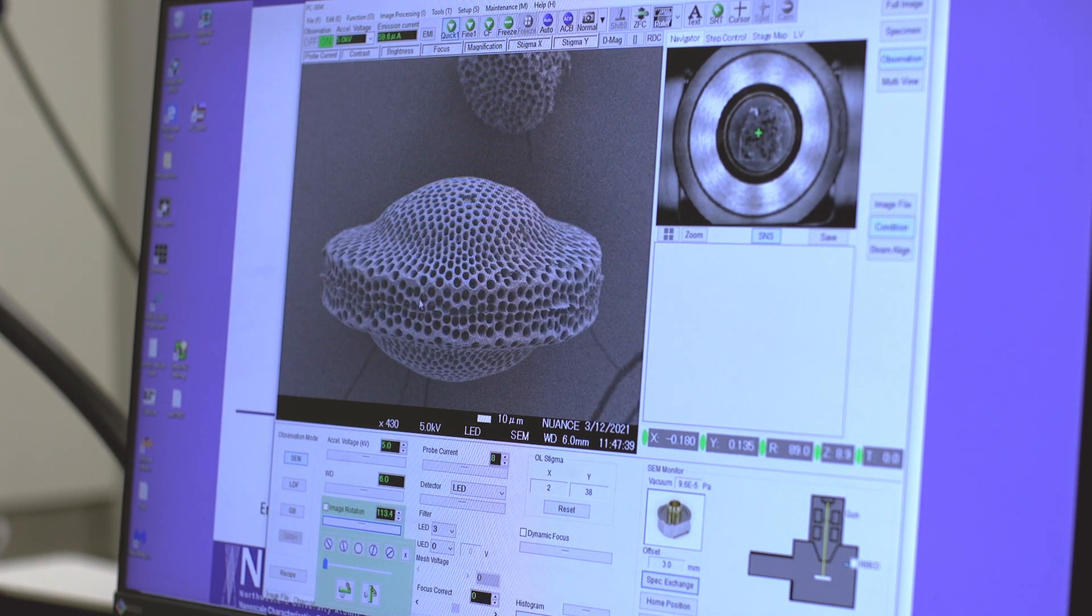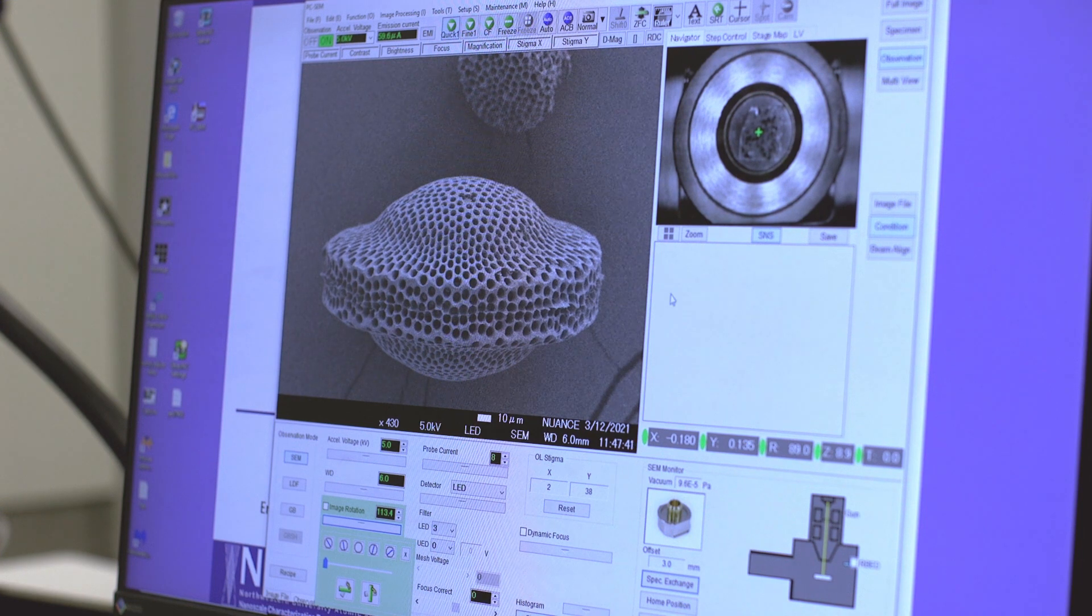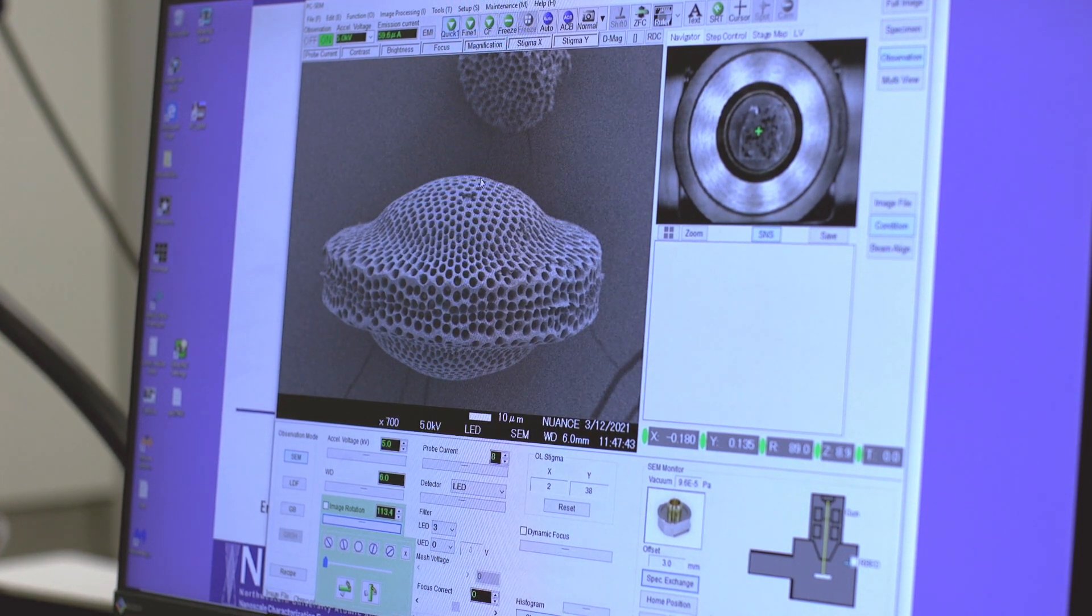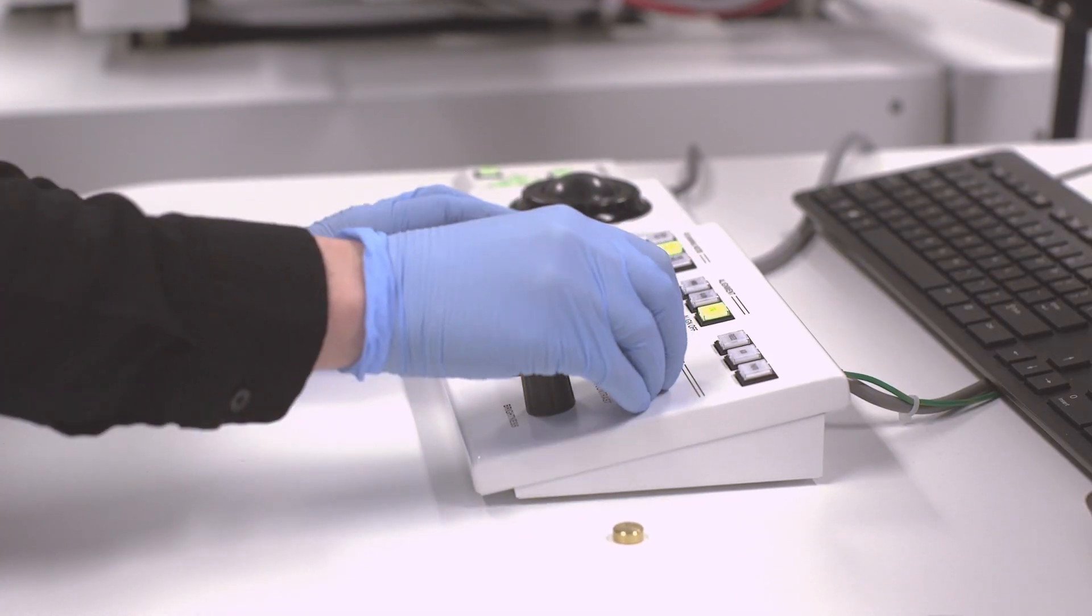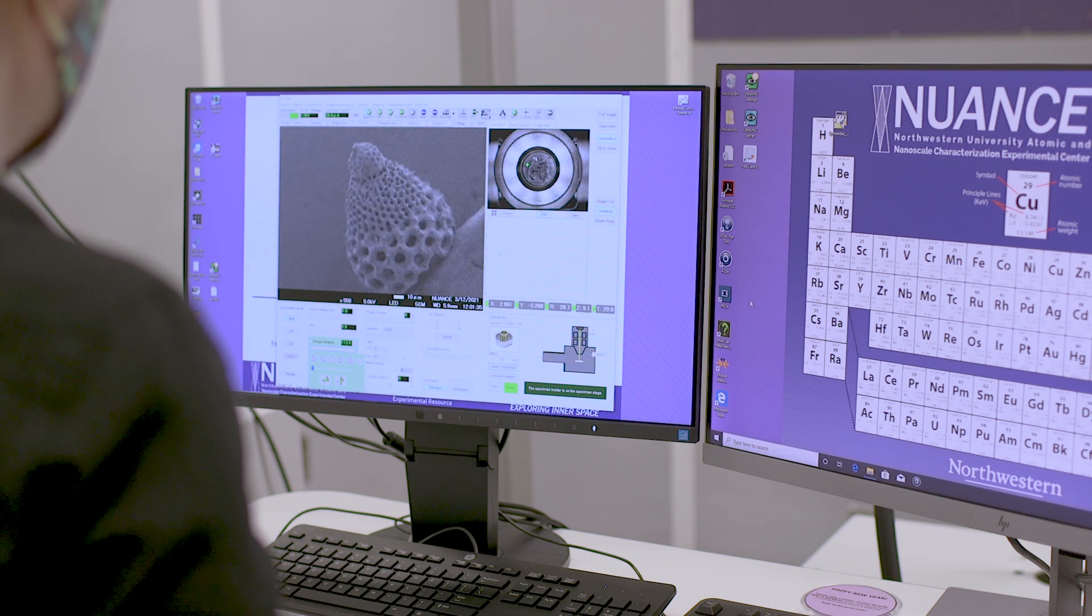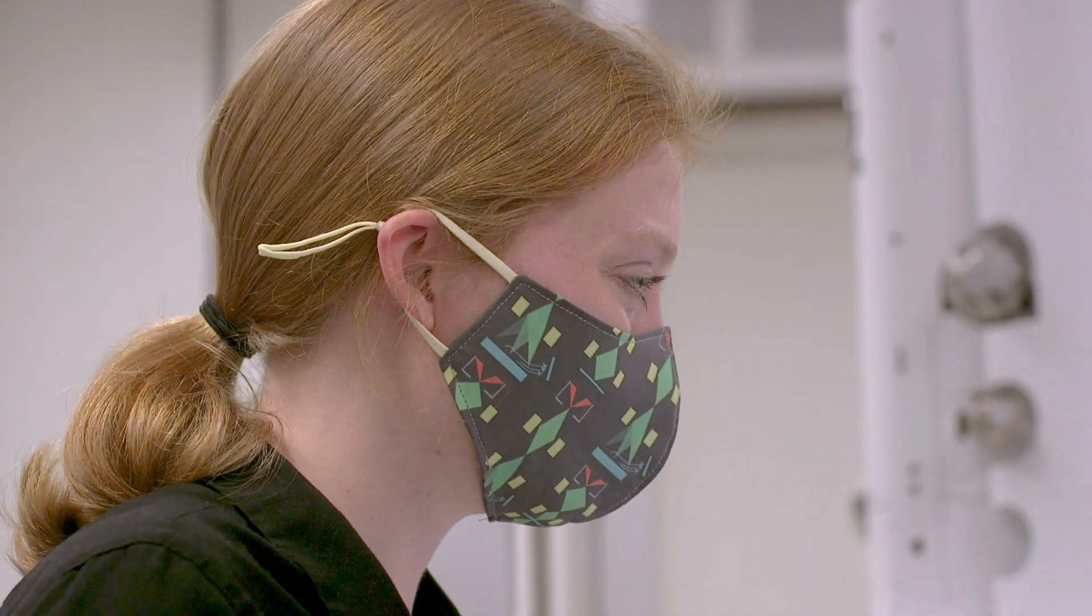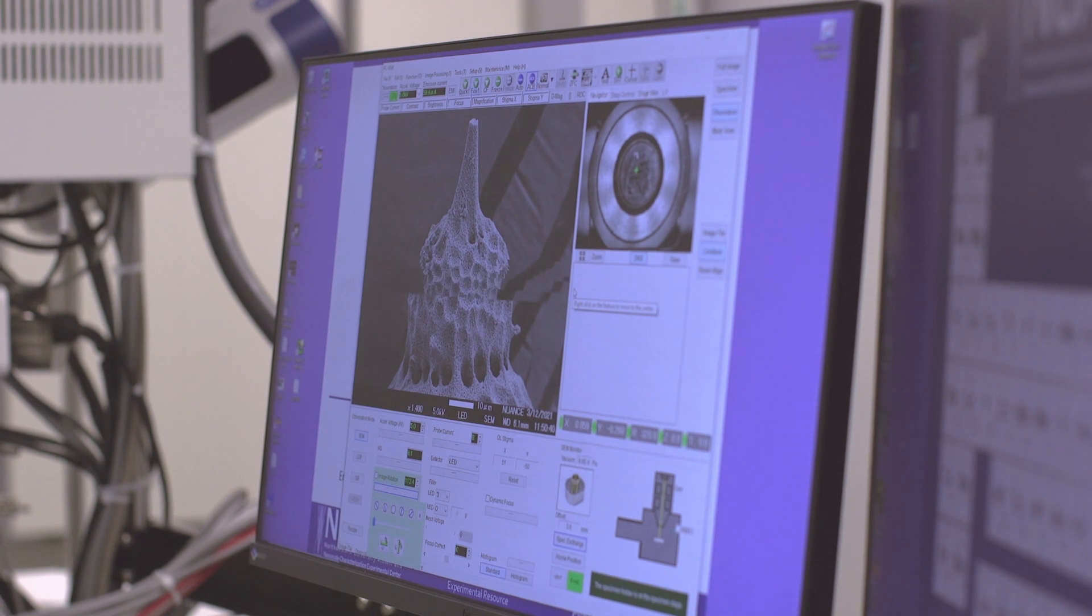This particular radiolarian looks like a UFO. If that's what a UFO looks like. They actually all are kind of weird shaped, which makes them so much fun to image. But this one in particular is pretty cool. I don't know if I would wear this hat.